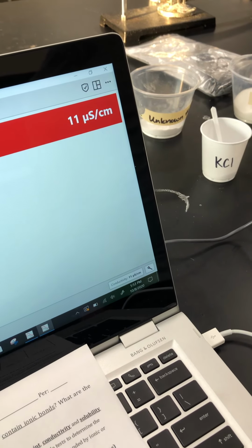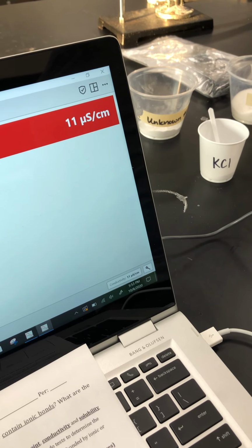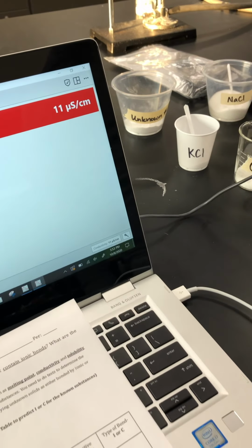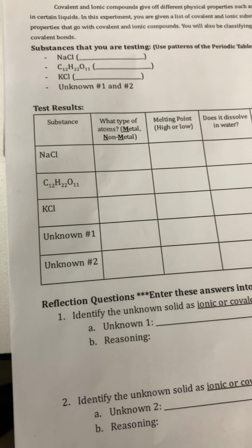So again, it's not 0, but it definitely didn't go past 1,000. So this one's probably non-conductive in water. So now you're going to use these results to try to determine the identity of unknown 1 and 2.